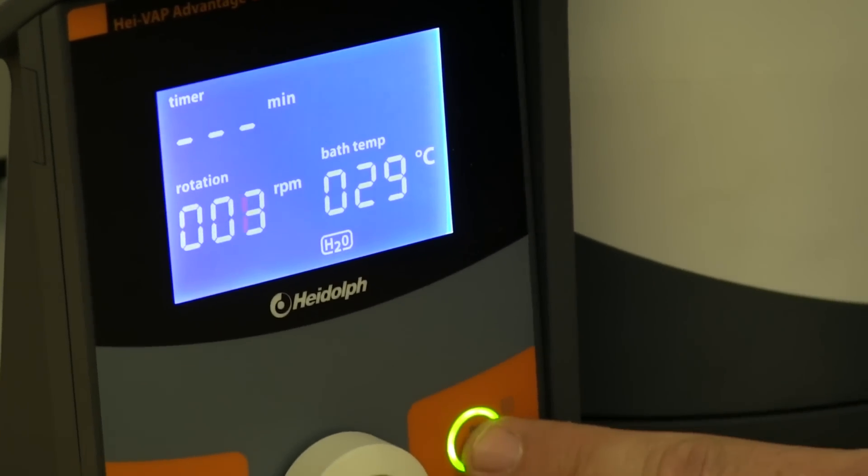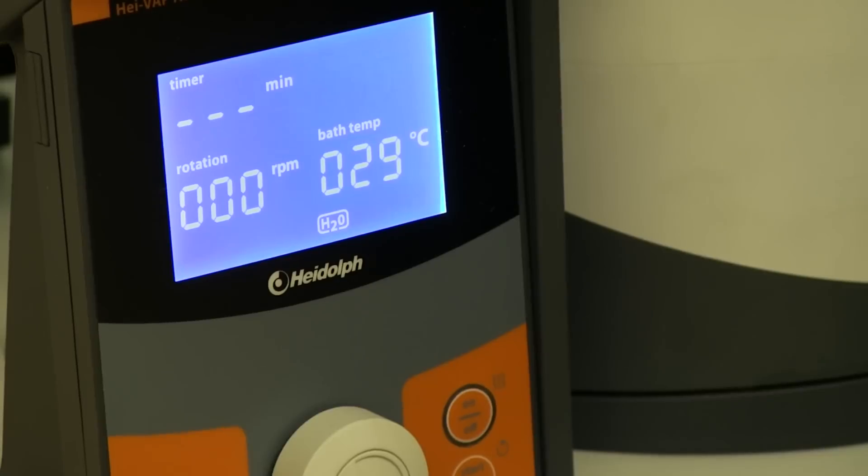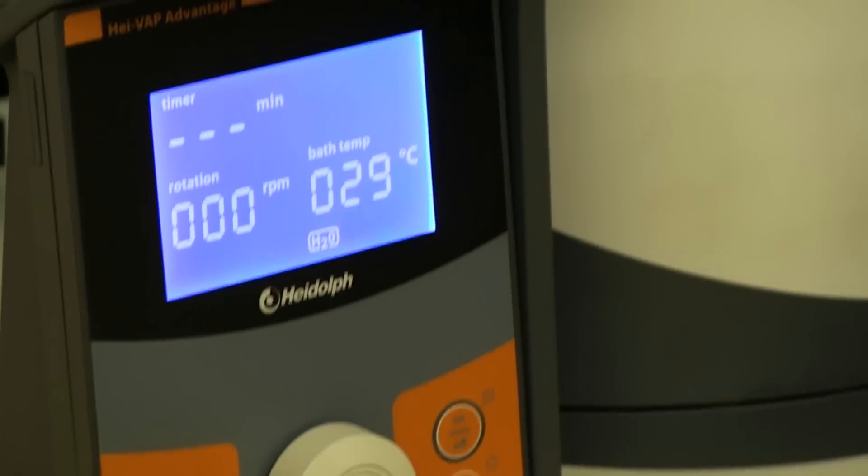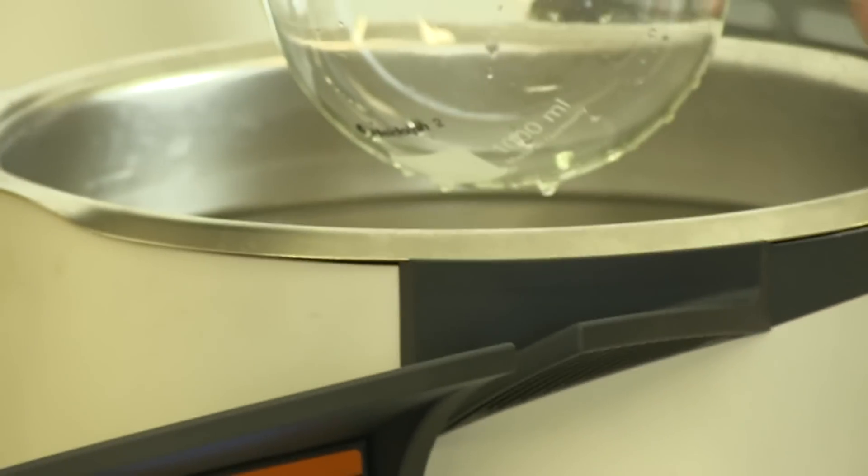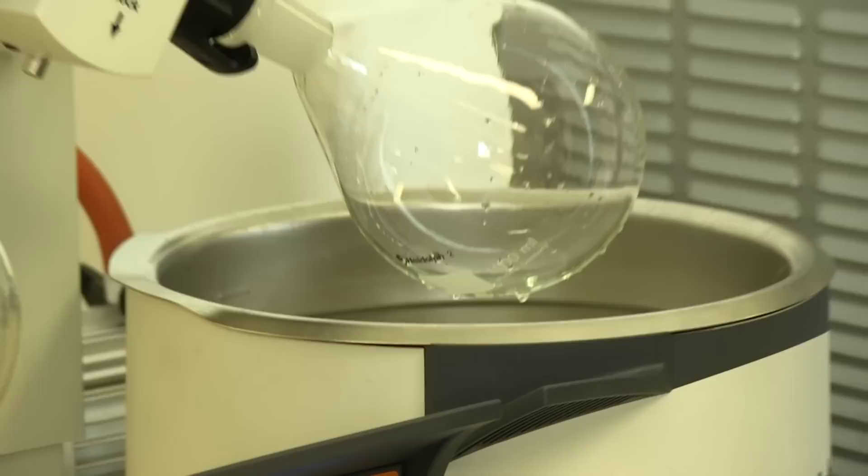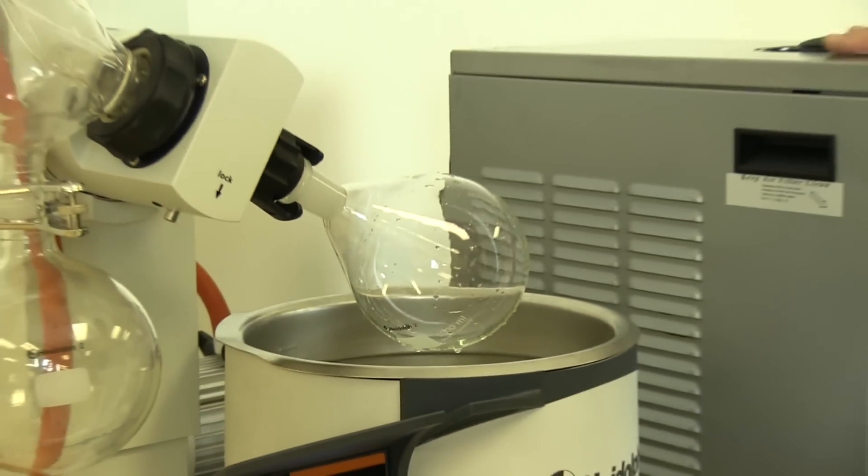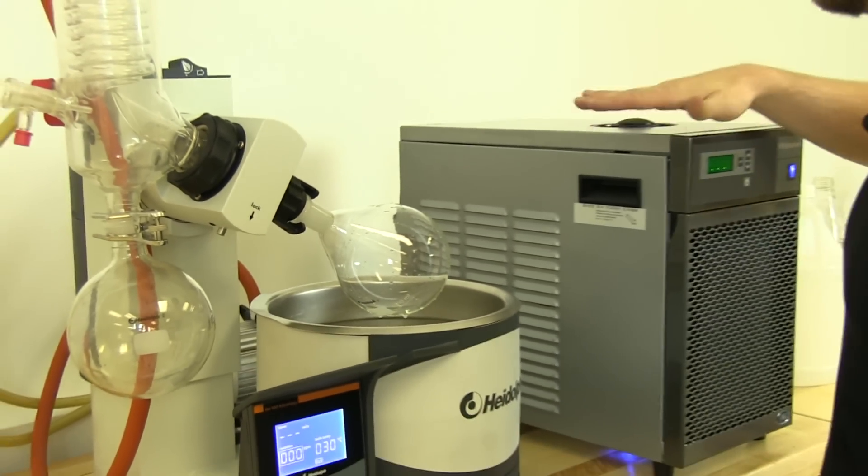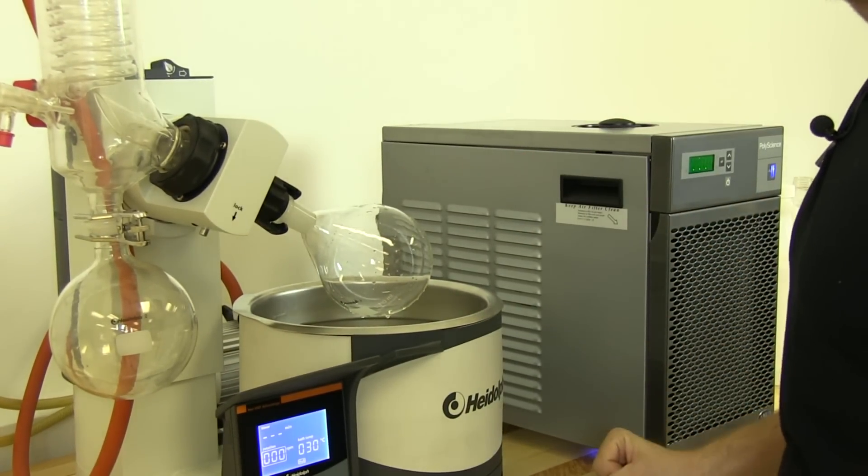Stop the rotation. Turn off the heat for now. You can raise it up and then we're going to show you how to fill and make sure that we have the proper chilling going on with the evaporator here.